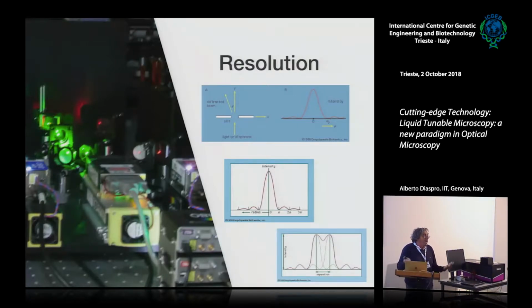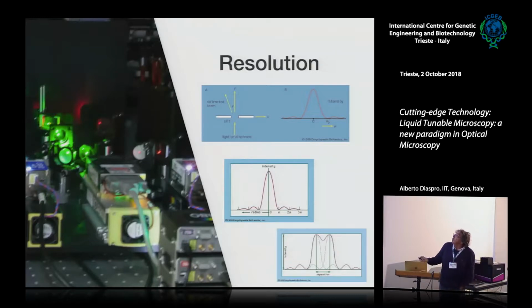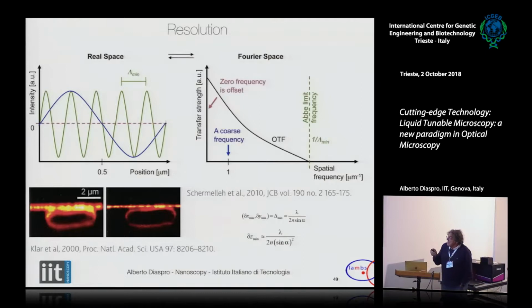I'm sure that you know everything about resolution, but just to be more sure, let's discuss a little bit what we mean. For sure, it is your ability in detecting two points when they are close one to the other at a certain distance d. So this is what you normally call resolution. And you have seen from Alessandro and from others the classical definition. This means that if you have changes of intensity in space, and these changes are very fast, so objects are very close, you can detect them or not within a certain limit. If these changes are less close one to the other, it's easier to detect them.